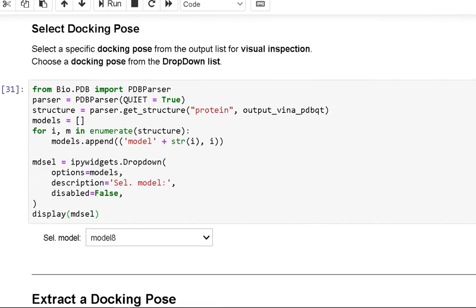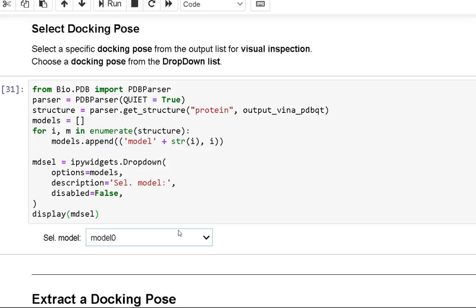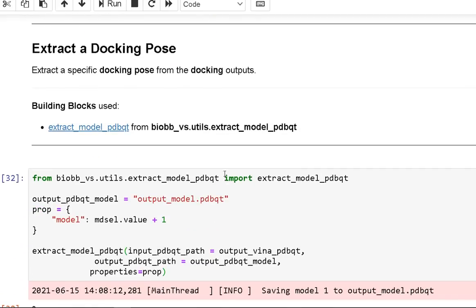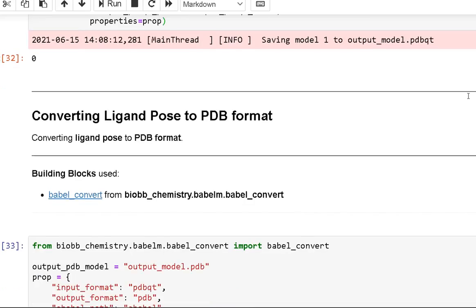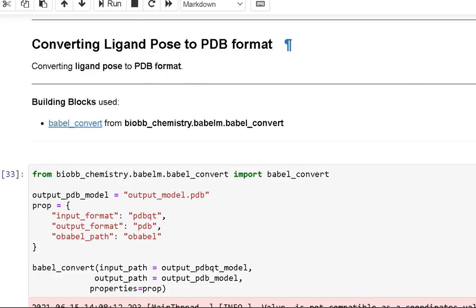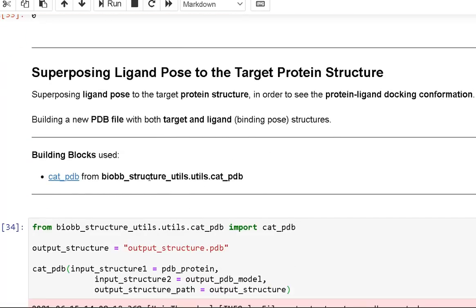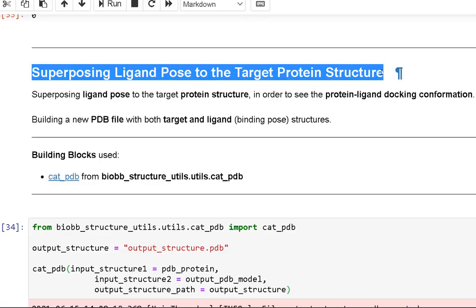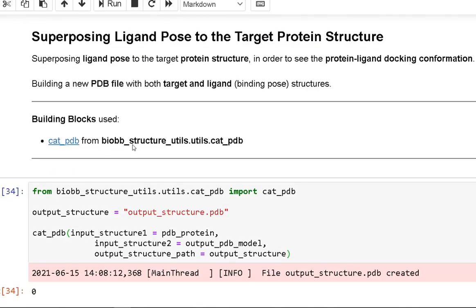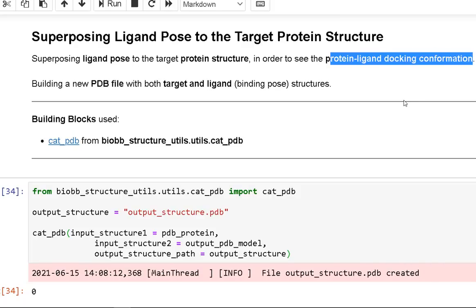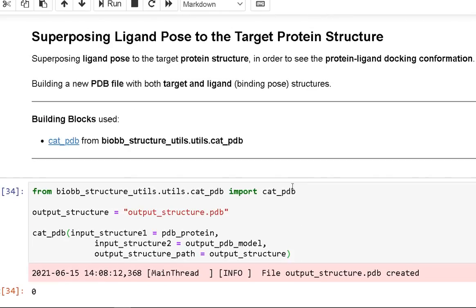To select a docking pose for visual inspection, choose a specific docking pose from the output list using the drop-down menu. Then extract that specific docking pose from the docking results, and create a PDB file from the ligand posture. Finally, superpose the ligand position to the target protein structure to visualize the protein-ligand docking conformation, creating a new PDB file that includes both the target and the ligand structures.